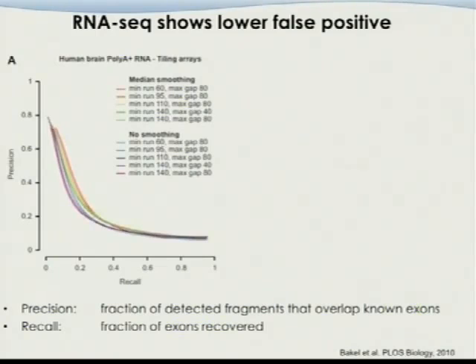For the Affymetrix platform, I think the first one came out around 2005. At that stage, they needed seven arrays to tile the entire human genome. That is equivalent to, I think, 13 million different probes, or 13 million features. That's a lot of information. If you do the experiment, it will cost you a lot of money as well, because of seven arrays, and for most of the region we know that there's nothing there, right? We just don't know where they are.